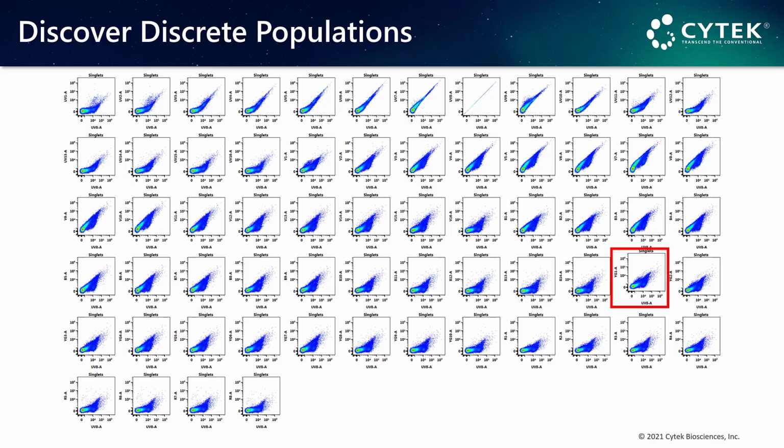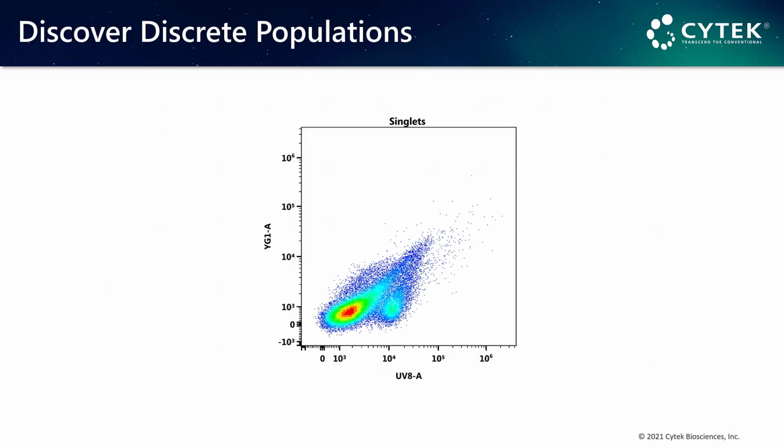The UV channels are related to autofluorescence from many cellular metabolites that are involved in survival, and the yellow-green 1 channel coincides with expected autofluorescence from flavins, which are a significant contributor to autofluorescence in eosinophils. In this way, I'm really hoping to be able to characterize the autofluorescence from infiltrating eosinophils, which is one of the populations of interest in this assay, as distinct from the lymphocytes, dendritic cells, and the resident skin cells.